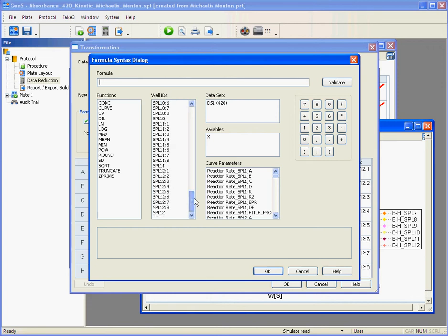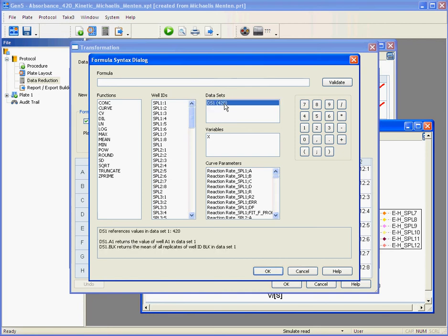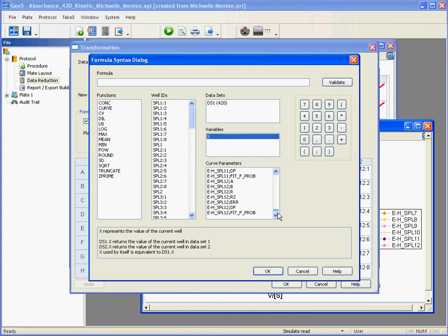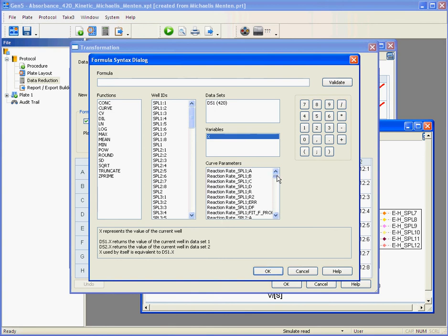Here the list of all your well IDs available on your plate map. Your data sets, here we only have one but we can have multiple data sets. Your variables and here all of the curve parameters that have been calculated by Gen5 in previous data analysis steps.